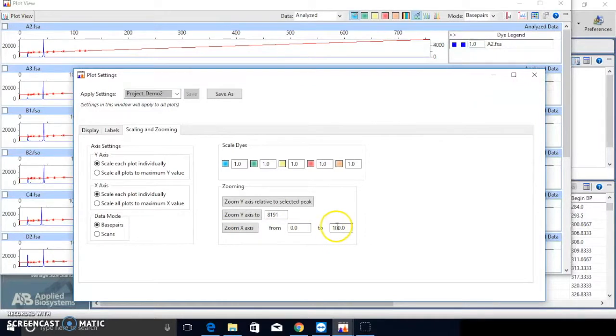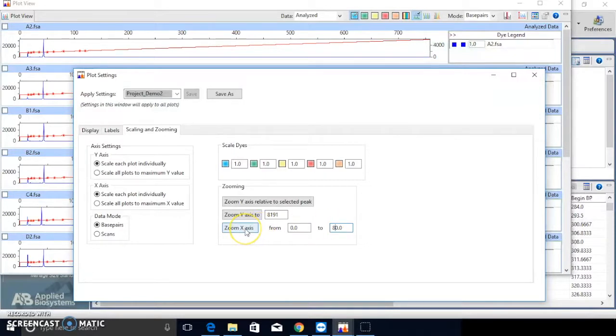Here, I zoom x-axis for more details. Make sure you click the Zoom x-axis button after you update the settings.